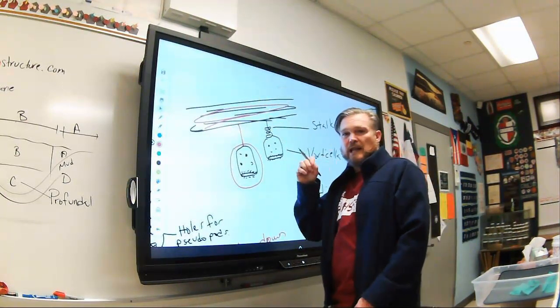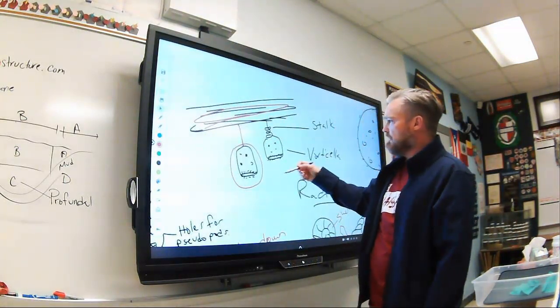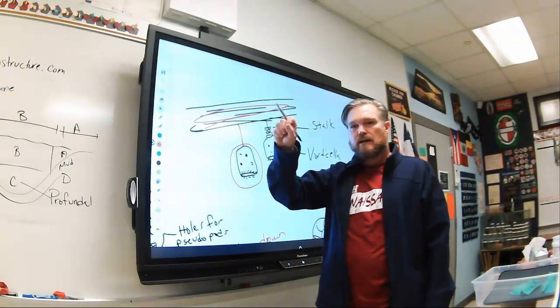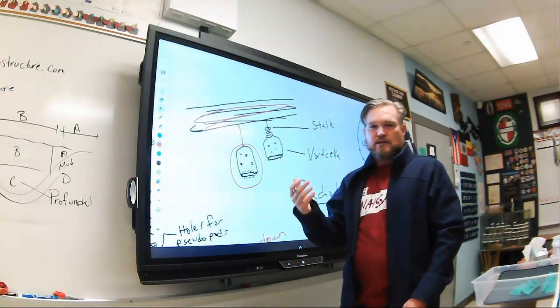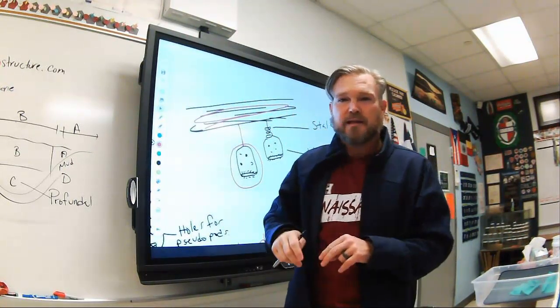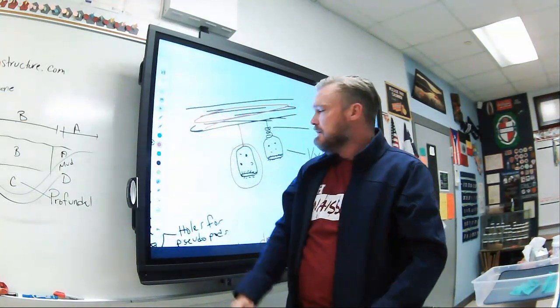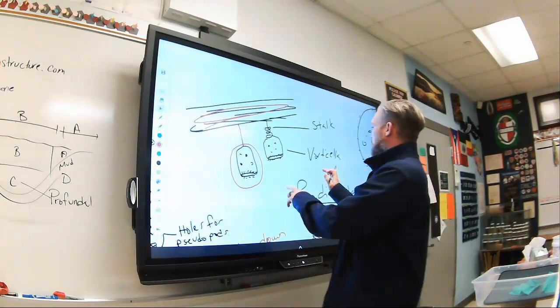Or they can also relax it and then come out, and then they actually will do filter feeding. So you know, if there's particles and stuff, they can actually move out and come back, and move out and come back, which allows them to essentially hungry hippo. If you've ever played that game, they come out and they grab food, and they come out and they grab food, right? And that's kind of the same idea here. So Vorticella are kind of cool.